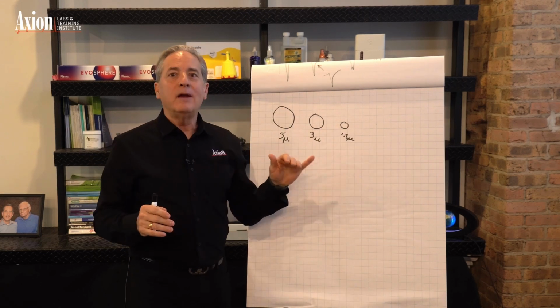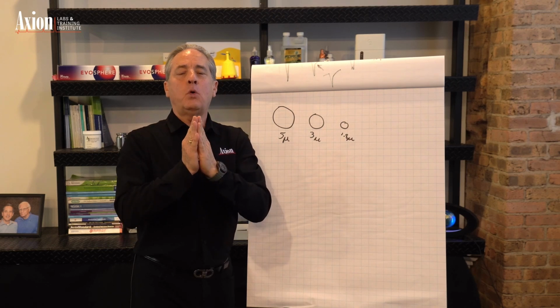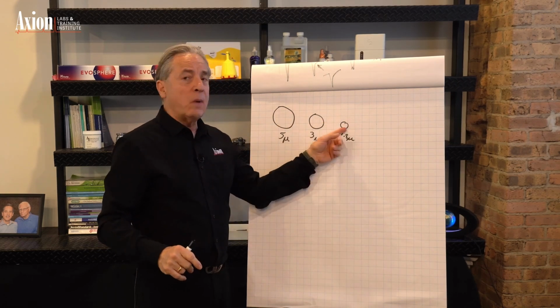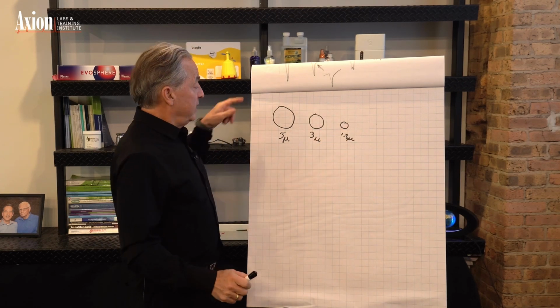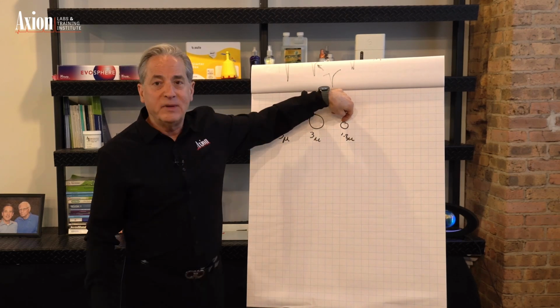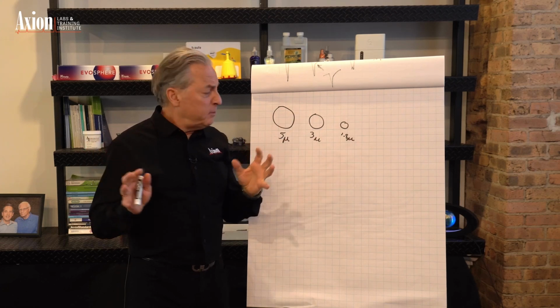Ooh, 1.8 micron, you get the idea. Even fewer choices, the peak gets even skinnier. So chromatography, no brainer. Van Deemter said, 1956, make the particle smaller. But now we run into the physical problem, and that is, if this guy is running 2,000 psi, this guy is going to be 8,000 psi. So now we have the physical limitation of the pump.